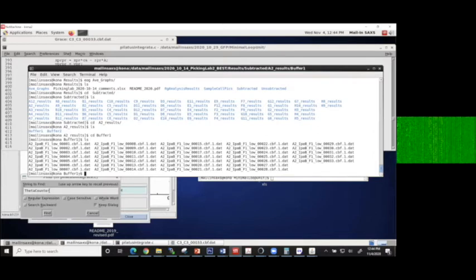And it's impossible to know ahead of time when it would occur. So you might only be able to use the first 5 frames, or you could use all the frames. So that's why there's a whole series. And I'm going to show you a tool for integrating that stuff. Okay.